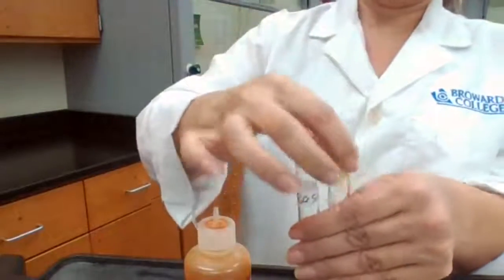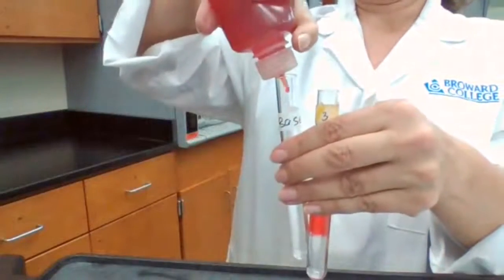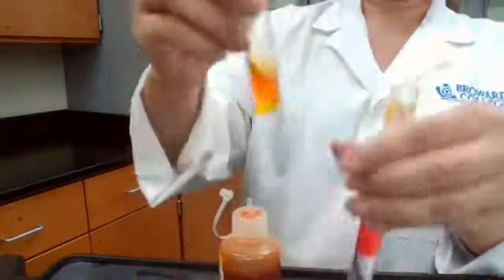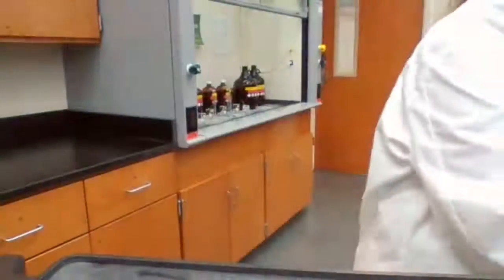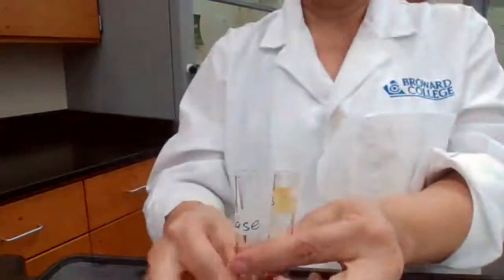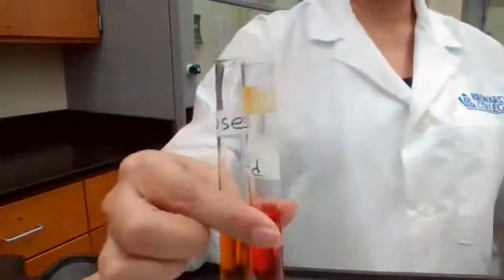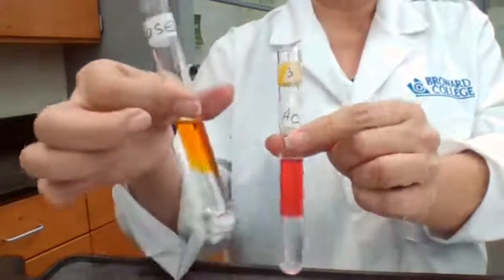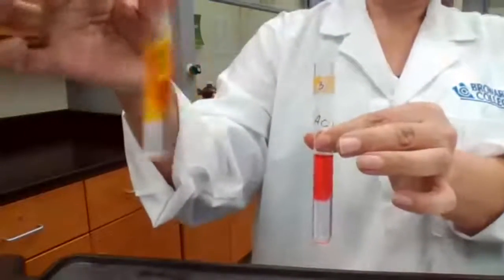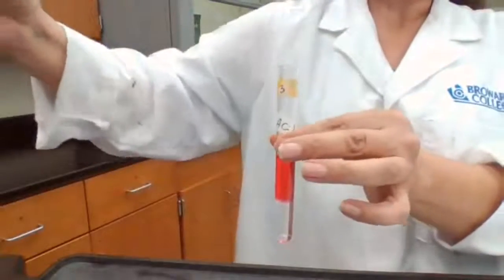And in base, the color is yellow. Record your observation. If you have your data sheet open, you can record your observation. In the acid, red color, and yellow color in base.